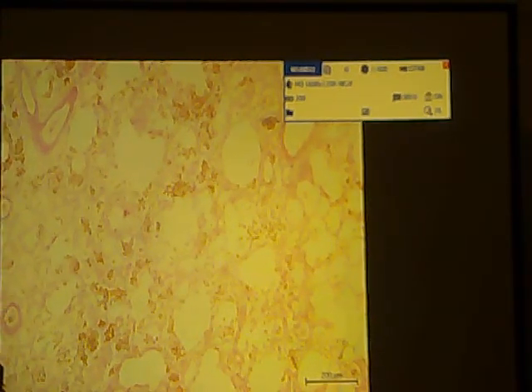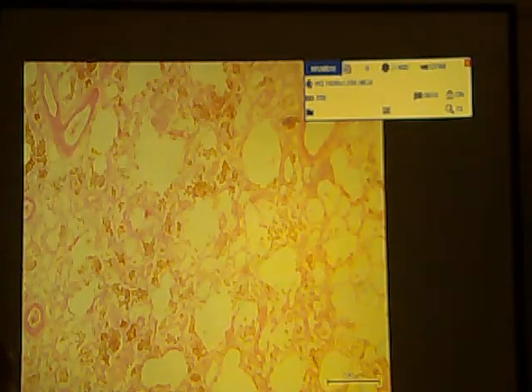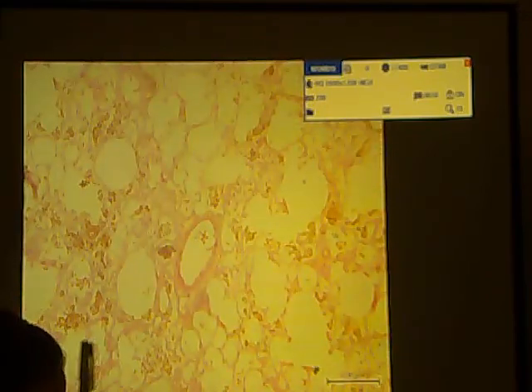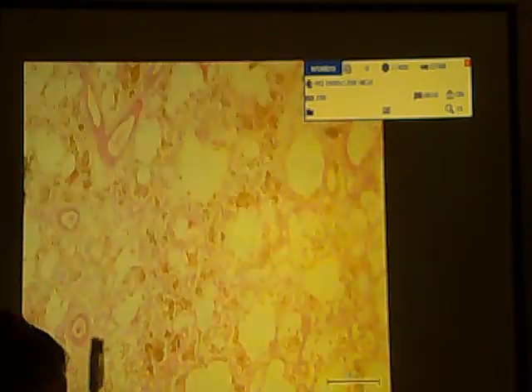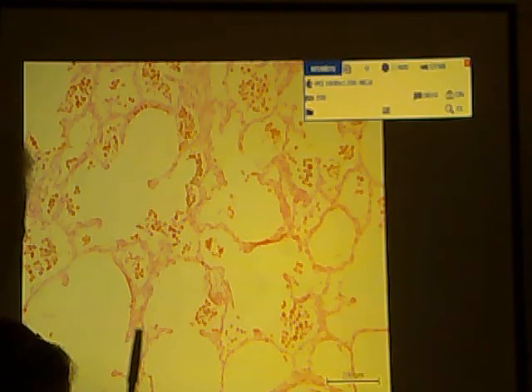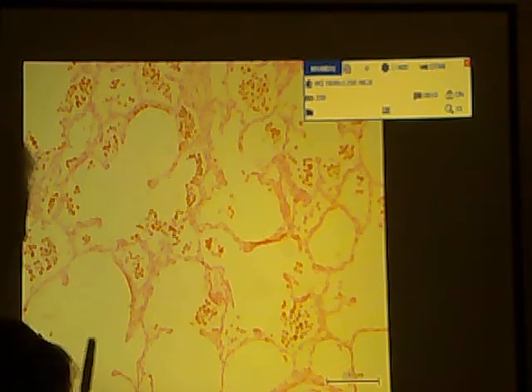Specimen, tissue, lung. Okay. So what do you see in this lung tissue? You would see lots of hemosiderin-laden macrophages inside your alveoli, and you would also notice the lung is congested. And it is also written in the manual that you will see your interstitium is thickened but not fibrotic.